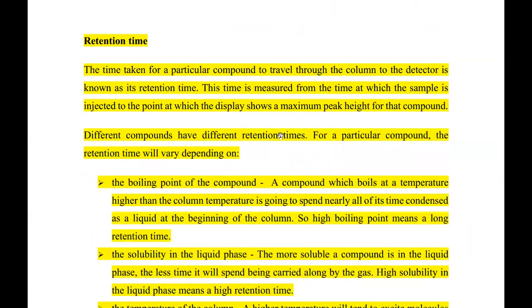Okay, some of these things I just ran through them. Now we're saying retention time. I think I talked about this RF value, which I said is mostly common in thin layer chromatography as well as paper chromatography. Now, there is a point that I like bringing out in a dramatized way. If mom and dad are going to the market, and you say, mom and dad, I want to go with you, of course, the one who's driving could be dad or could be mom.